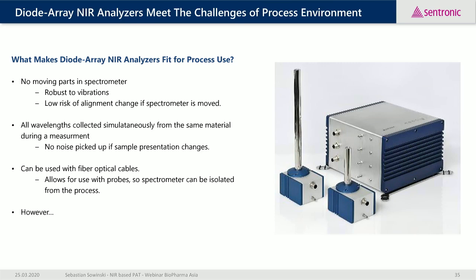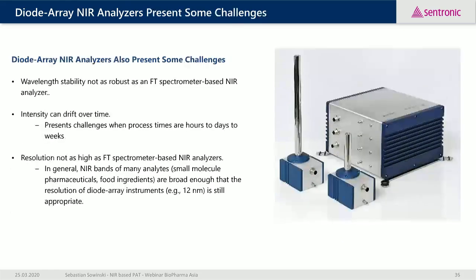However, diode array spectrometers are sometimes claimed to not have a wavelength stability which is as robust as an FT spectrometer or scanning system is. This is true, but there are solutions to overcome this issue.